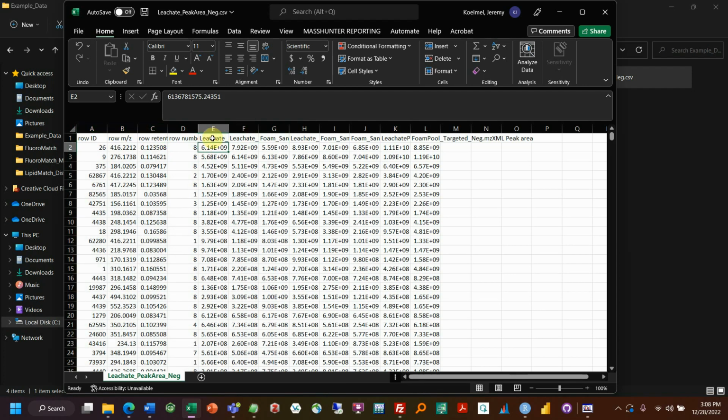So the last thing is if you have statistics, then you might have a bunch of columns with your peak areas or peak heights or concentrations, whatever it may be. And the name of each column might be the name of your sample, for example. But you might want to either rename or make sure that your files, before you run whatever your workflow is, are named accordingly so that whatever groupings are part of the name.